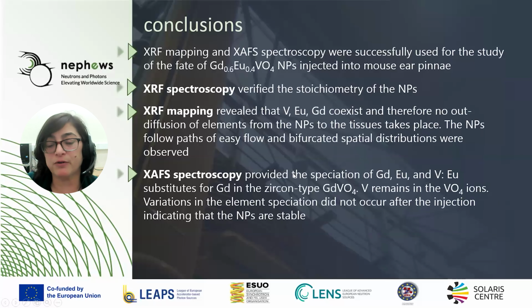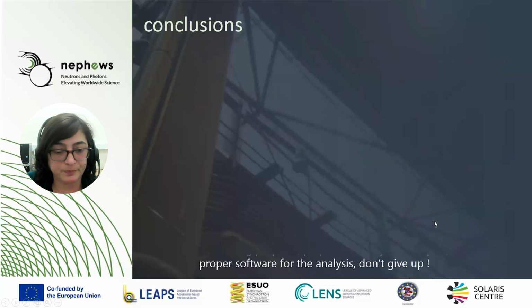XAFS spectroscopy provided the speciation of gadolinium, europium, and vanadium. Europium substitutes for gadolinium in a zircon-type gadolinium vanadate structure. Vanadium remains in the vanadate ions, and variations in the element speciation did not occur prior and after the injection.